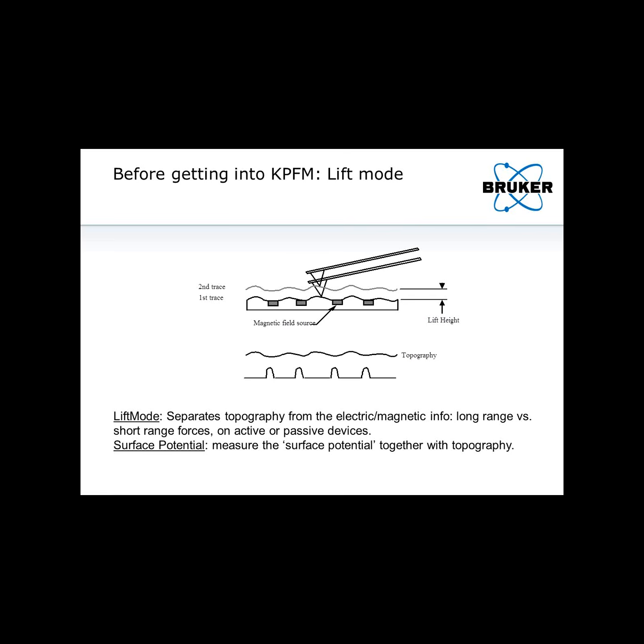So your first trace is your typical AFM trace. You will use tapping mode or, for instance, PeakForce tapping, which is what we prefer. And then your second trace takes the information obtained on the first trace about the surface and simply retraces that exact surface topography, but at a small height above the surface.